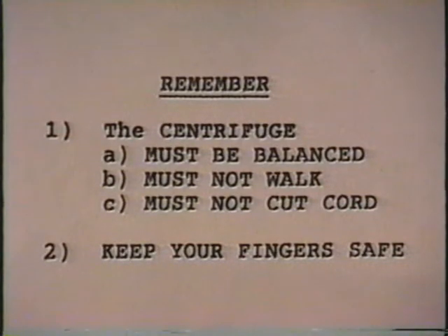In using the centrifuge, remember, make sure it's balanced before you turn it on, and then watch it when it's spinning, so it doesn't tend to move around. And don't let the spinning head touch anything, particularly the electrical cord. You can cut it. And finally, watch your fingers.